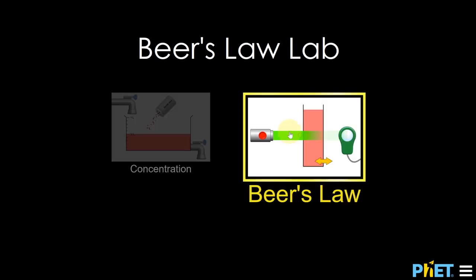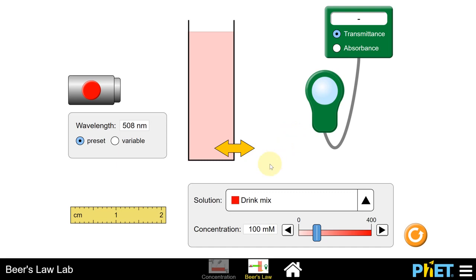And we're going to use the Beer's Law one, so you want to be on this Beer's Law side if you go to that address. And if you click on that a time or two, it'll take you to this screen. Hopefully, you'll find this without a whole lot of trouble.